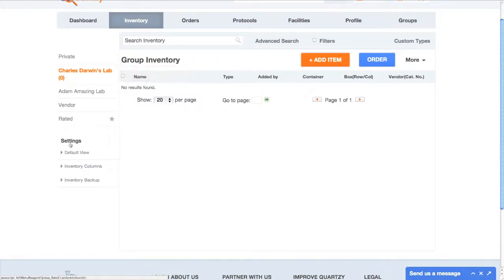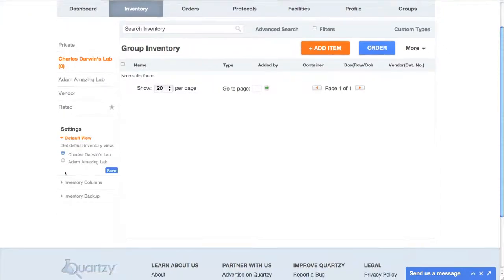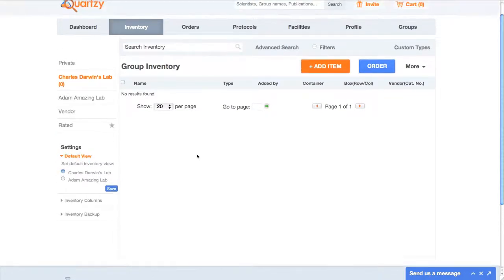If I click the default view setting, I can easily change the inventory I see when I sign into Quartsy. Now, an inventory is only as good as the items it contains, and this one's empty, so let's add some stuff.